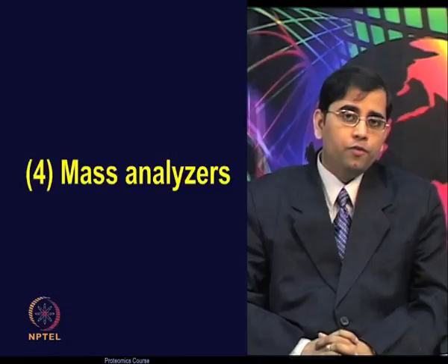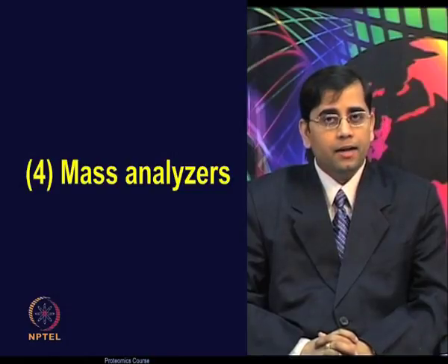There are different types of mass spectrometers currently available, but for proteomics there are 2 configurations which are most commonly used: the quadrupole time of flight or QTOF based configurations and hybrid linear ion trap Orbitrap instruments.